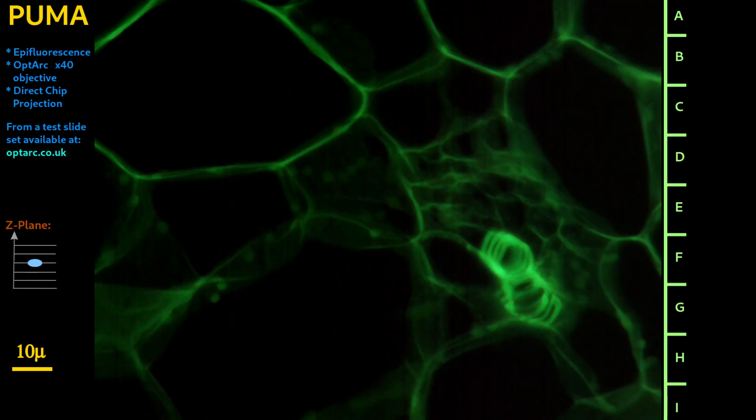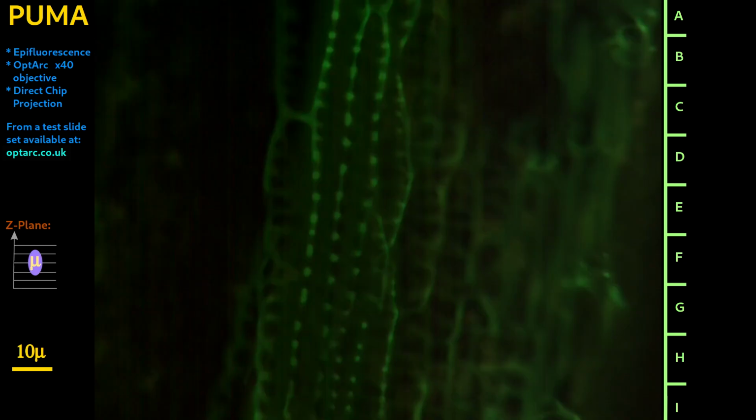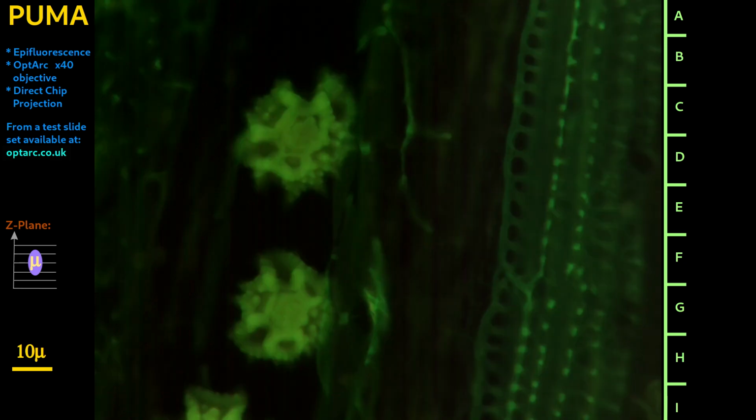Here are some examples of vascular coil structures seen at slightly different focal planes and with some images showing you the average of several focal planes. There is some background noise in these images, and that's because the camera used is not a dedicated low light level cooled CCD camera, but a generic CMOS camera used for bright field microscopy.